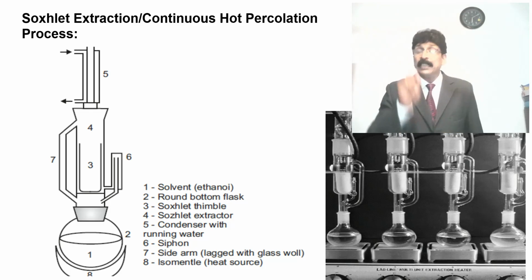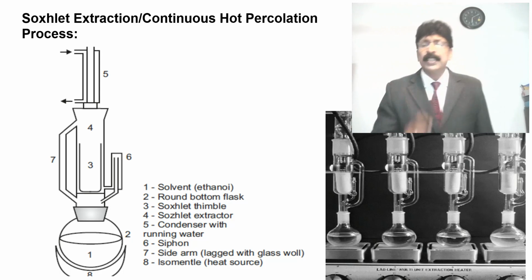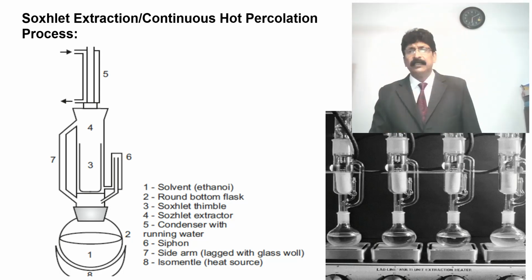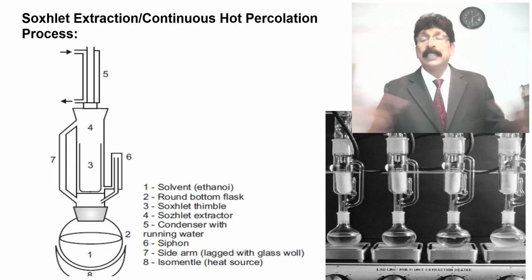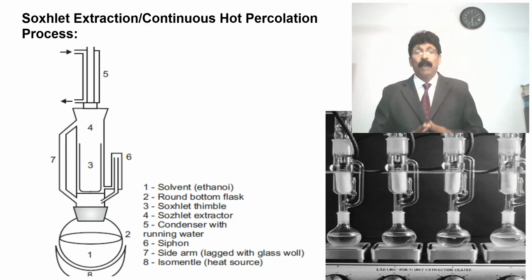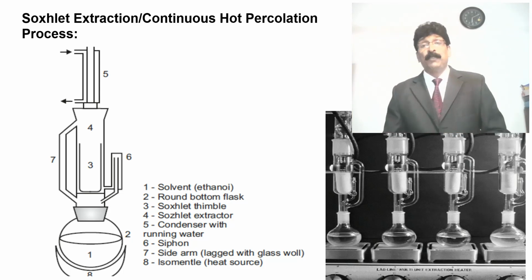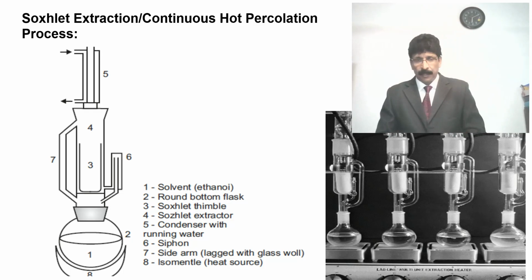The temperature may also be controlled, and you will get a very good extraction and can go for various chemical tests and identification. Smaller pilot-type Soxhlet apparatus are also available, and larger capacity, even 1 liter, is available. The round bottom flask can also be increased up to 2 liters to increase the solvent system. Bigger water condensers can be prepared.